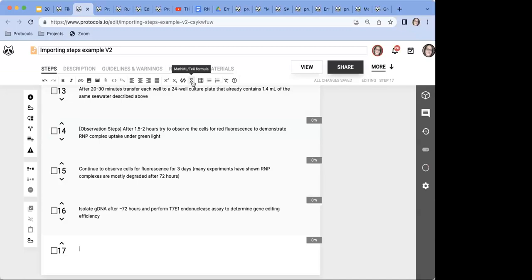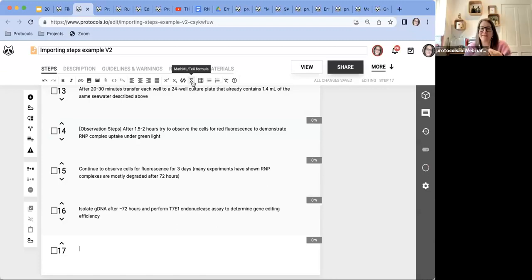No, absolutely fine. We have so many nice options included already. I'm really impressed. Good, I'm glad. You can always try copy paste for things, but when it's special characters and formulas, I would be very careful with that. So that's why maybe an image is slightly safer.